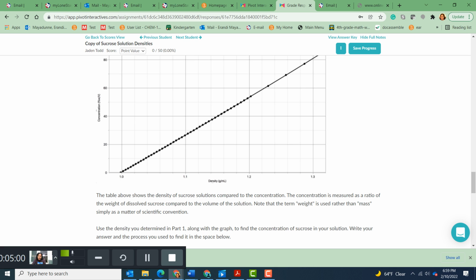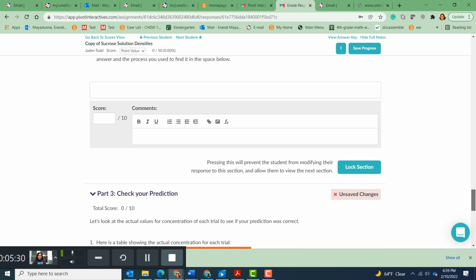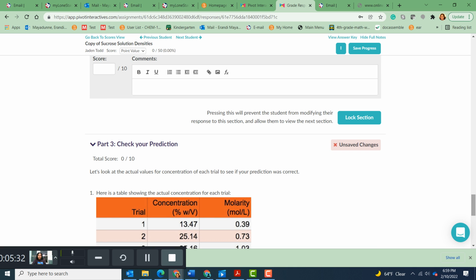I'm thinking it is not 20, not 10, it is in between, very close to 20, but I was thinking it's 16. I'm just guessing, because I cannot get the exact number since it's not graph paper. It is somewhere between 10 and 20, but more towards 20. So it should be a reasonable number. I'm telling you 16.